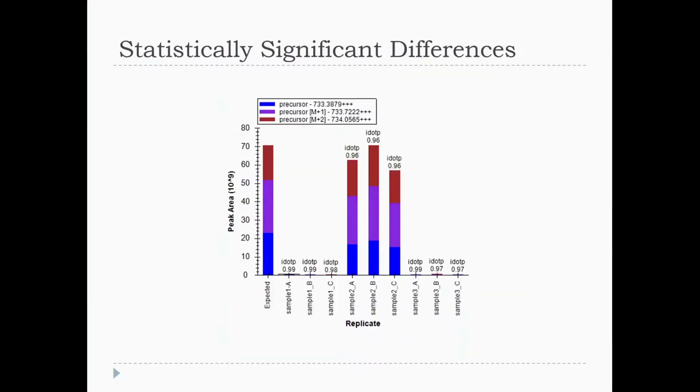Okay, how about this one? Anybody, is it changing? Yeah, no, okay. Can anybody see anything that they think is like, yeah, what? I can already tell that it's not going to. Did anybody have a hypothesis of why? This is in a protein. It's a single peptide for a protein, and we know the protein can't be changing. It's just a normal background protein. So anybody have a hypothesis as to why this is happening?